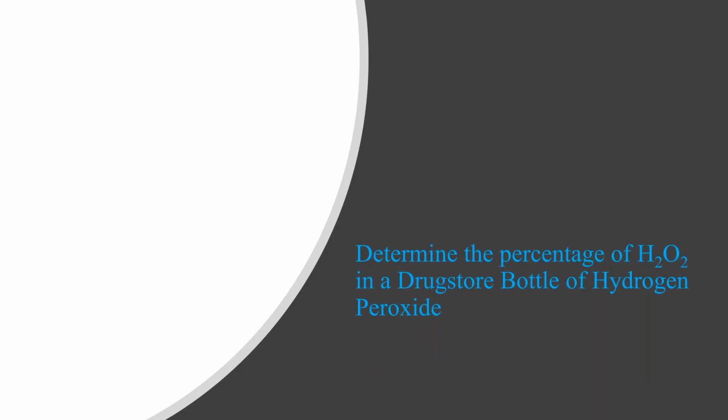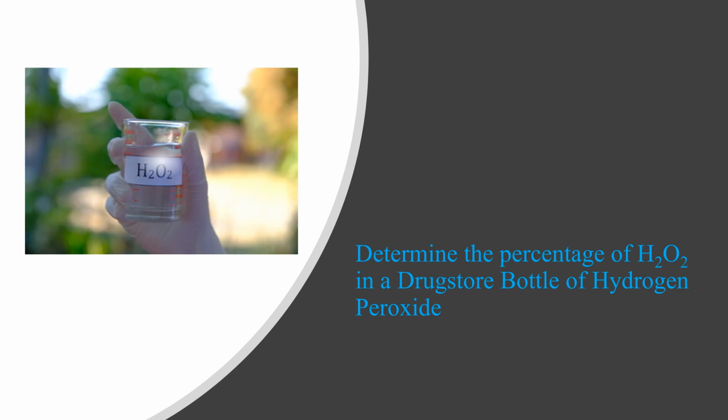Hello everyone. In today's lesson, we are going to determine the percentage of hydrogen peroxide, H2O2, in a drugstore bottle of hydrogen peroxide. So let's get started.